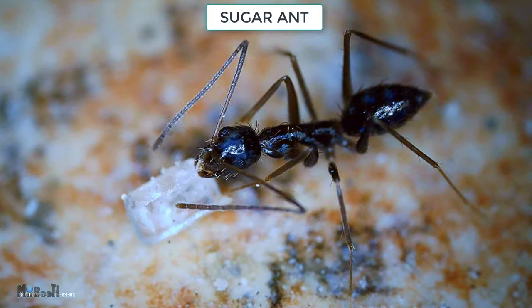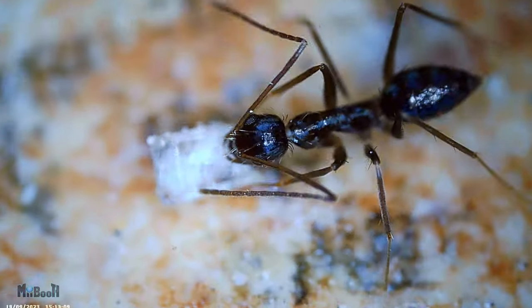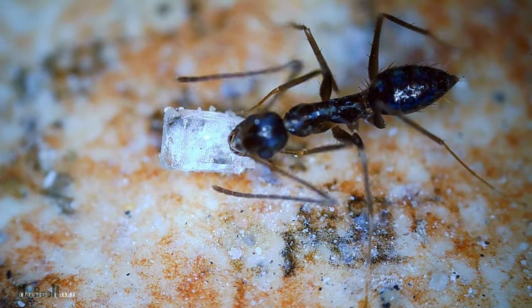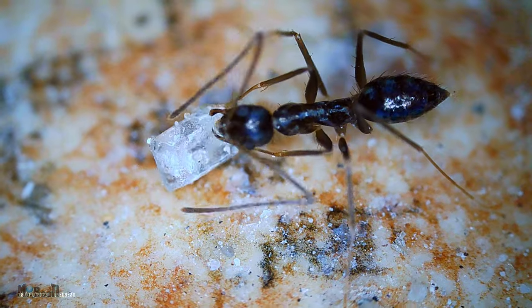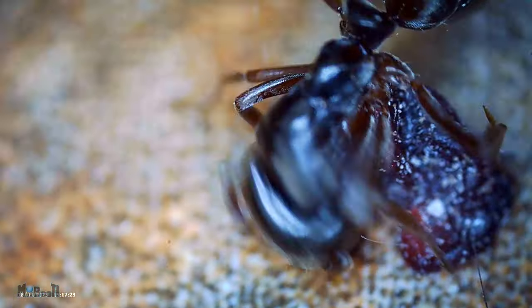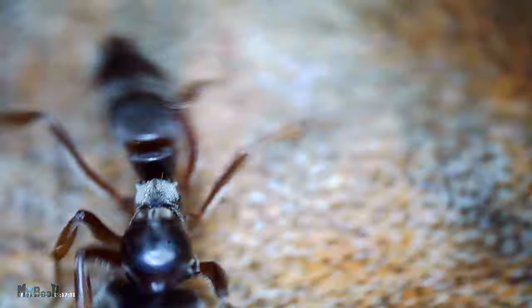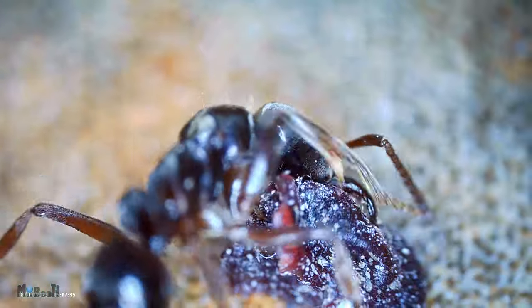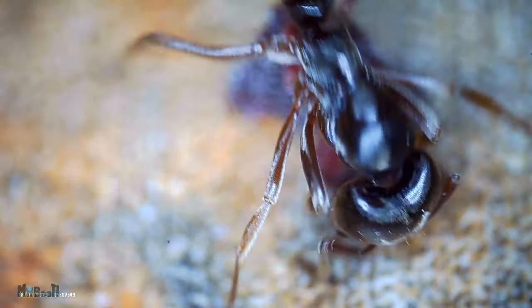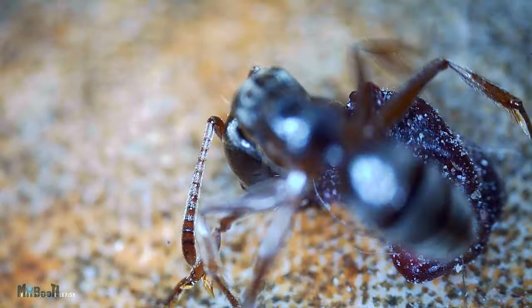And now the video you've all been waiting for. Ladies and gentlemen, feast your eyes on this ant feasting on a sugar crystal. Just like wildlife photographers have to wait hours, days, or months to get a good shot, I had to wait and run around some ants for a full 10 minutes before I had the idea to sprinkle some sugar and wait for them to come. Look at how it's trying to get it between its fangs — it's fascinating to watch. I also got a bigger ant trying to get some gunk off the floor and putting all its might into it. It got a bit angry at me for hovering over its head and made a run towards me, but it cooled down quickly and got back to work. This might be the best piece of footage I've ever gotten with a microscope, and I did this holding the scope in my hand chasing ants on the ground with one hurt knee — so the microscope has to get credit for making it easy.